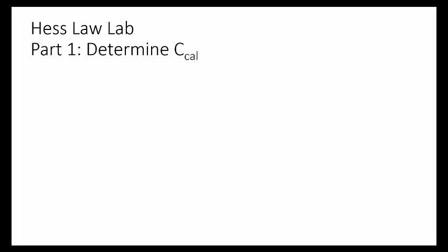In this tutorial we'll be going over the Hess's Law lab, just briefly, more the conceptual side and the steps you're doing. I'll try to keep the equations brief, and we'll wait till the post lab to go over that in more detail, like how you do the graphs and the calculations. All right, so let's get started.